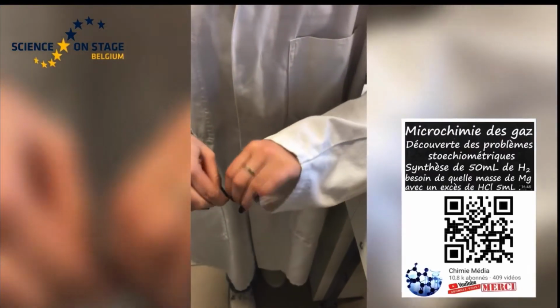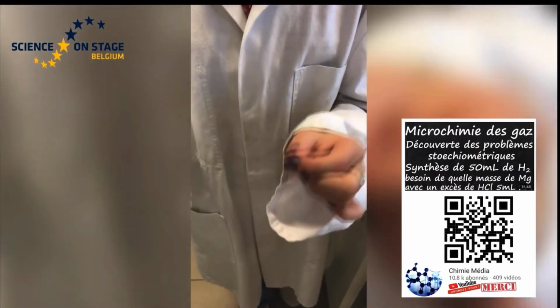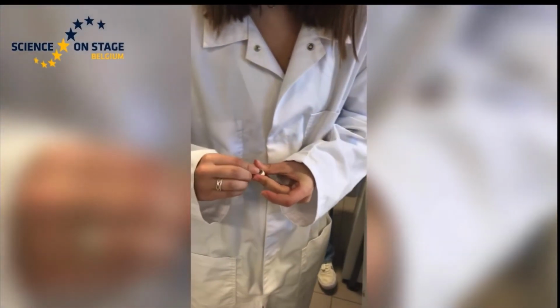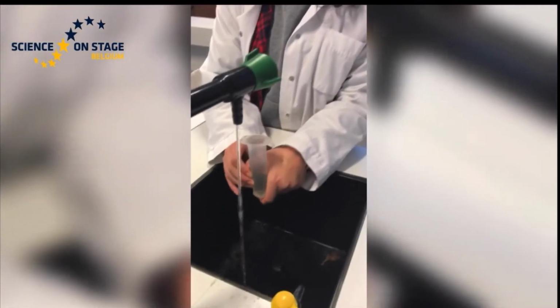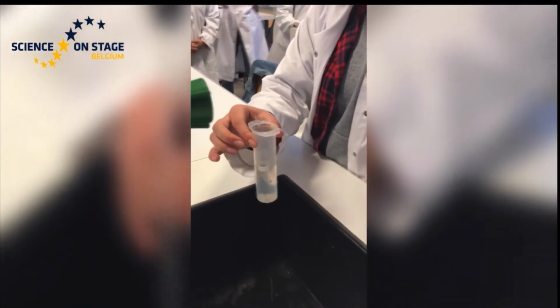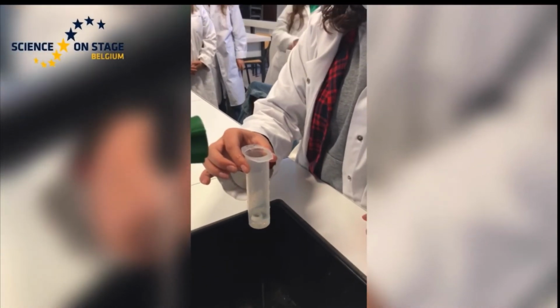Let's begin the reaction. We take 1.5 centimeter of magnesium tape. It's 0.05 grams of magnesium. We calculate it before with the stoichiometric problem. We roll it up and put it in the small white cap. It is used each time for the solid reagent. It should reach the bottom of the syringe without being overturned.